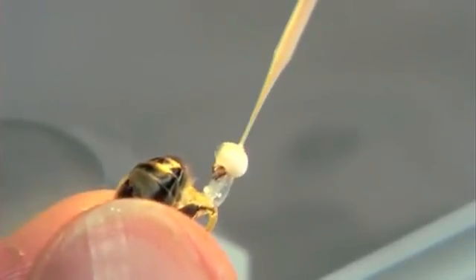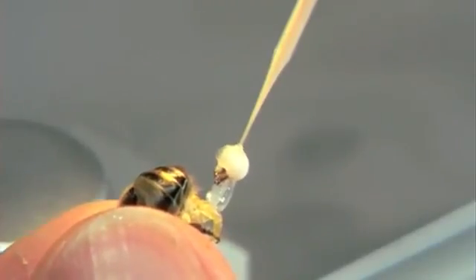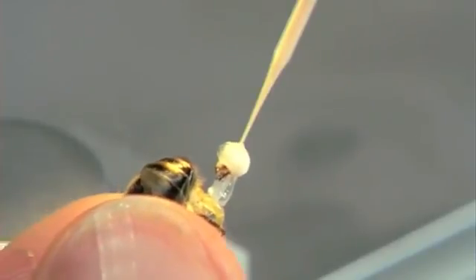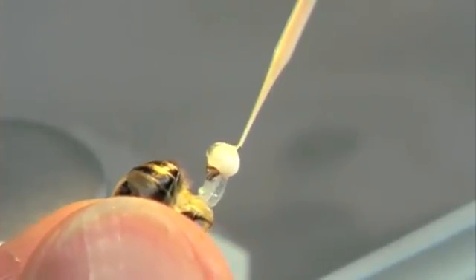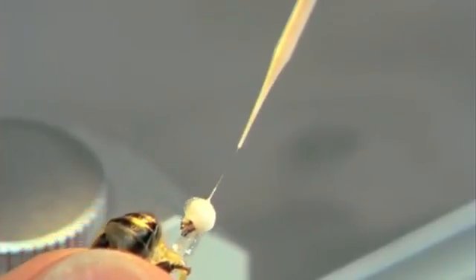Similar to the natural mating process, the semen of several drones is aspirated in portions. A minimum of 8 microliters are required for insemination. This corresponds to the quantity of semen donated by 8 to 10 mature drones.